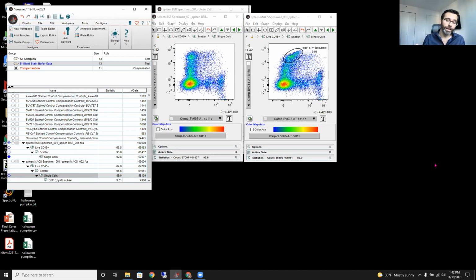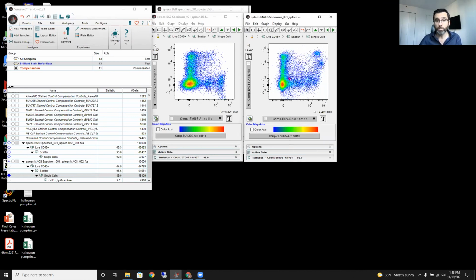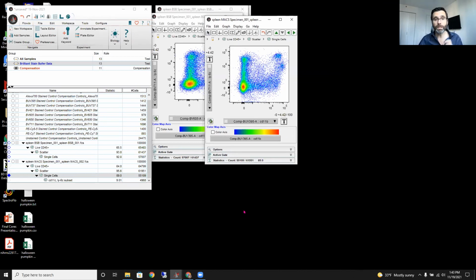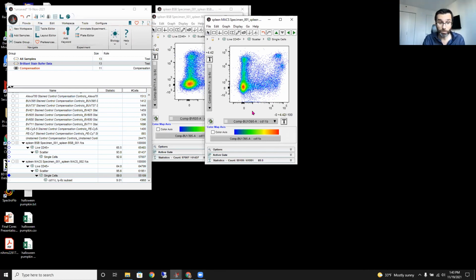So you may be lucky and you don't see any interactions, or maybe the populations that were being looked at were kind of mutually exclusive, and it's just lucky that no interaction took place. But in general, they will take place, and so it's really important to use this buffer. So I just wanted to comment that you might not see problems sometimes, but in general, you will see issues, and sometimes they may be so subtle that you'll have a hard time understanding if it's a biological phenomenon that you're seeing, or if it's just an artifact, right? And so that's why it's so important to just apply best practices and use that staining buffer. Yeah, I just wanted to comment.